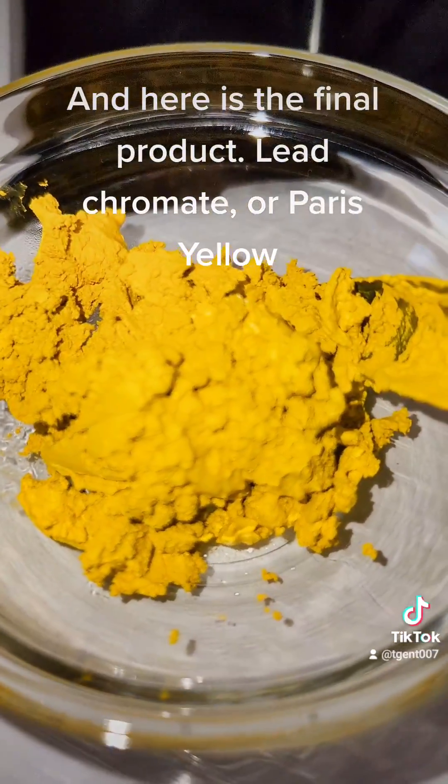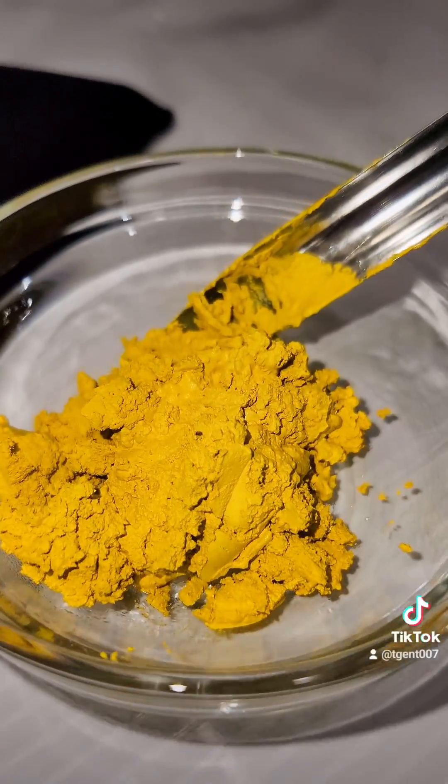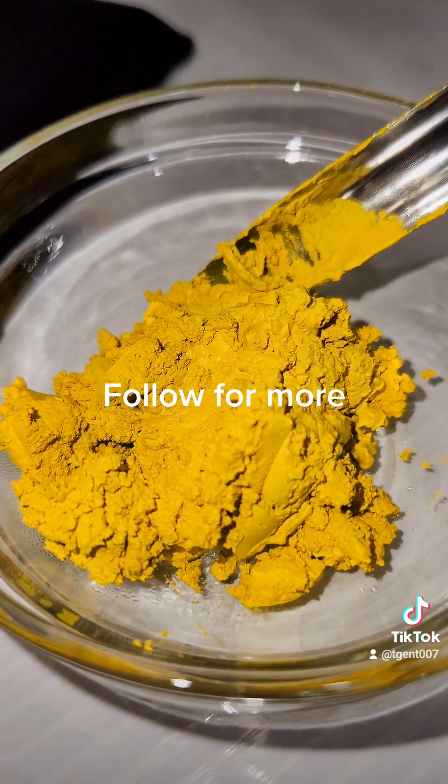And here is the final product: lead chromate, or Paris Yellow. Follow for more.